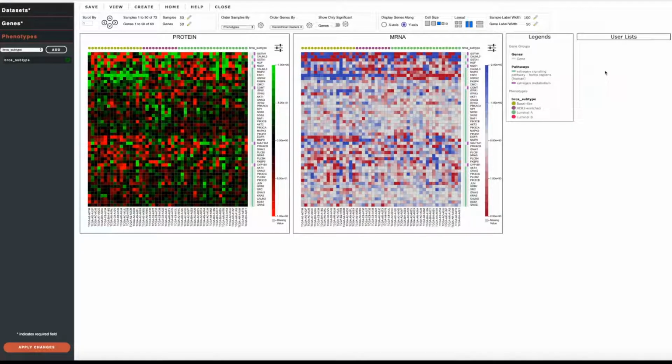User lists are useful for maintaining curated lists of interesting genes. Features in these lists can be downloaded and saved or quickly revisualized within the analysis. There are multiple ways to create user lists in multiSLIDE.